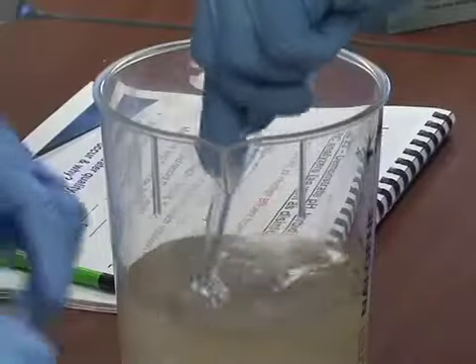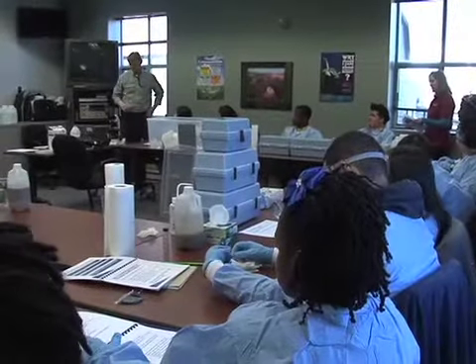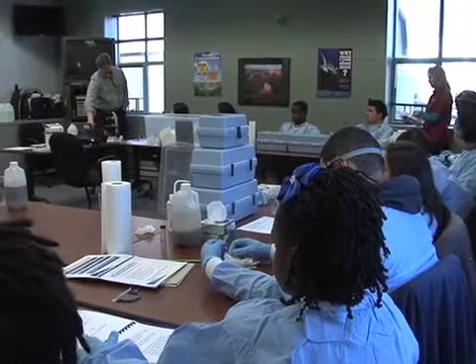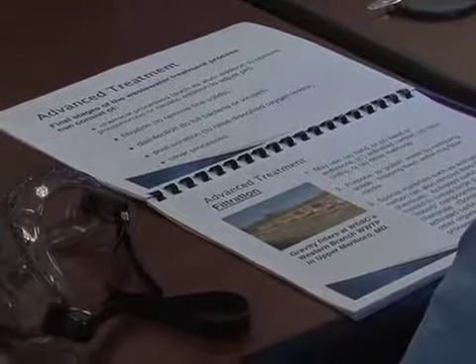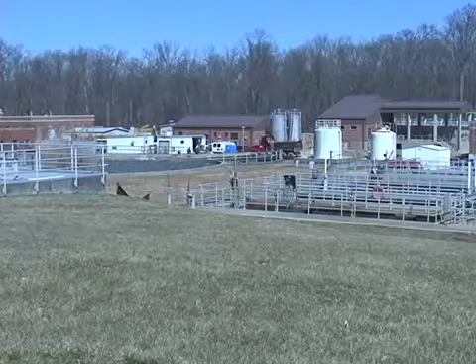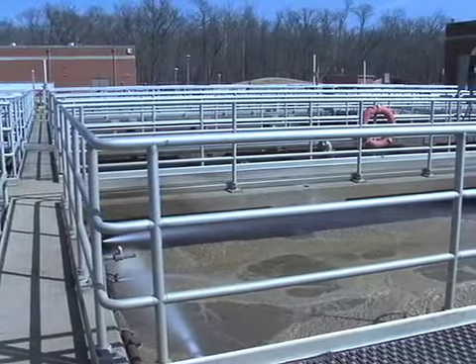So it's to give the students that are interested in science an opportunity to actually see things at the bench scale. That's what we're working at here, is the bench scale. And then we're working with the same types of tools that we work with in the plant. We describe the process, and then once we do it at the bench scale, we actually go through the plant, and they can actually see everything scaled up at the plant level.